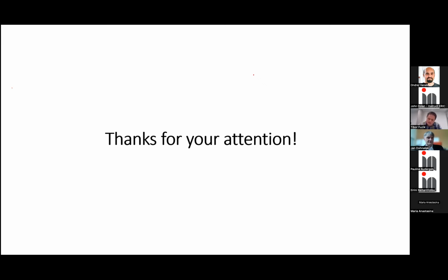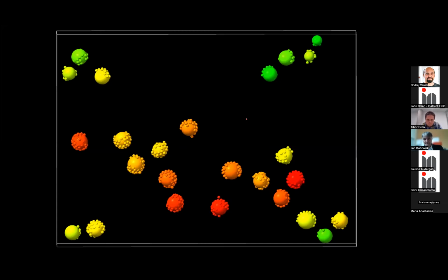This is because the clustering of the particles was done automatically so far. So there was no hand curation of this. Sometimes, if we go back, we can see some parasite particles, for example here, an extra particle that's obviously not on the particle surface. So something was mistemplate matched, and also it was not classified out during the refinement process. That's one cause of there being more than 60 of them.